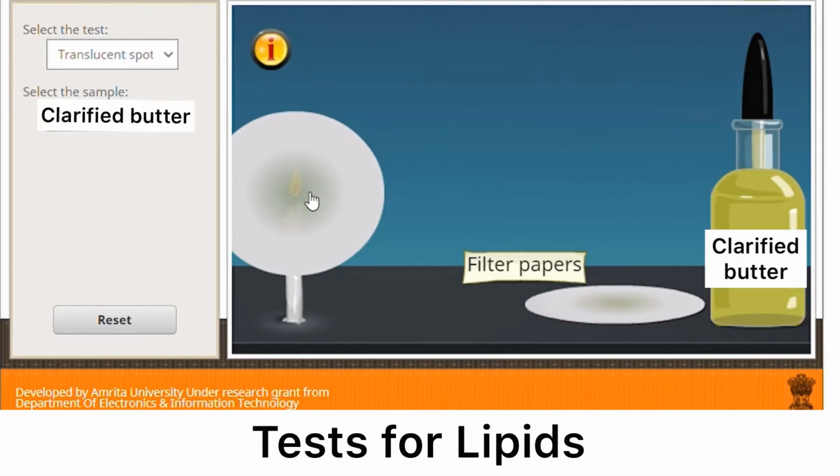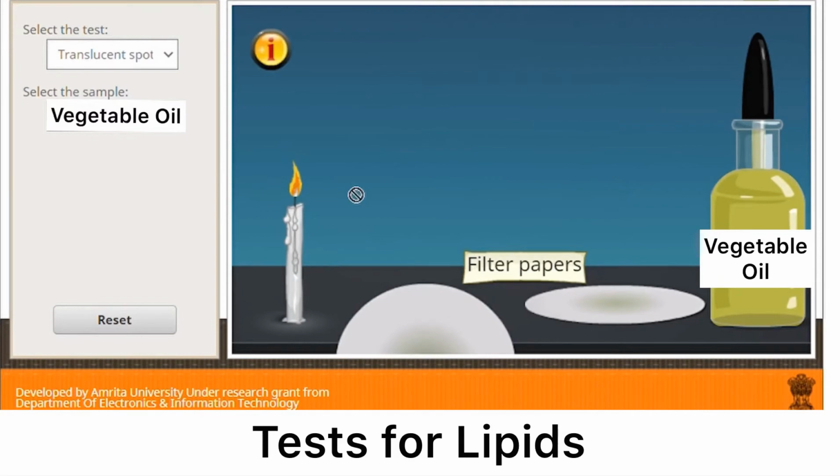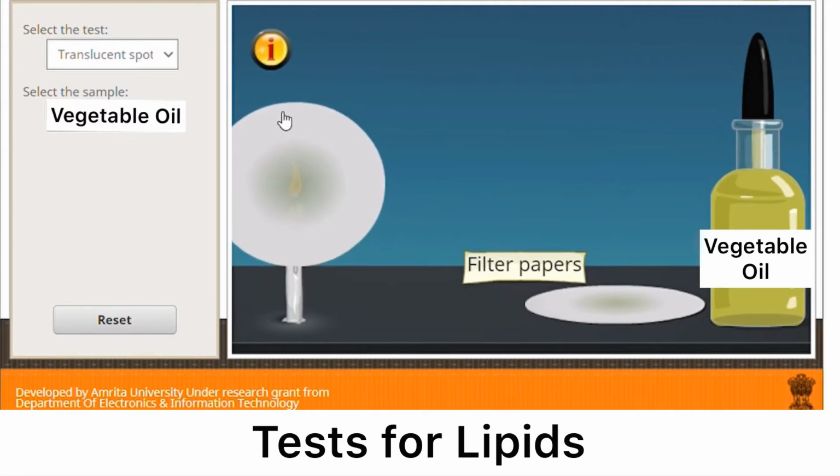Please make sure that you always record your observations as you will be needing this to answer your laboratory report sheet later. We will just be repeating the same steps for vegetable oil and linseed oil, and then observe and record your observations.